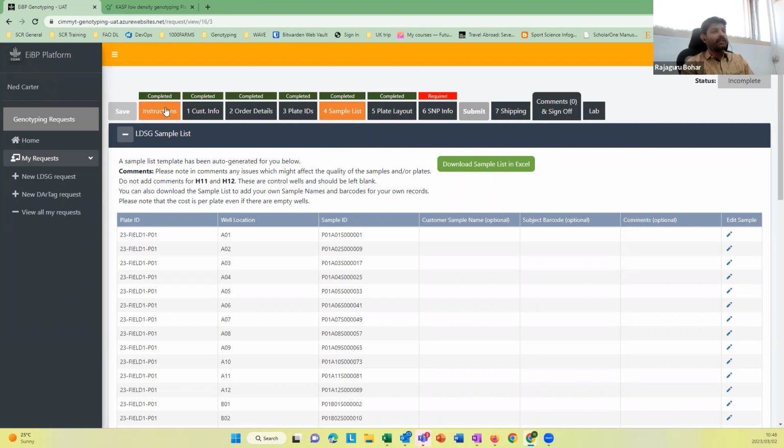There is a question from Brijay, which I think was partly answered. Maybe I'll take that question. How do you generate the unique IDs for Intertech? If you see, Brijay, the sample IDs were unique for one particular order. If you are talking about uniqueness between orders, there will be a unique ID for each order.